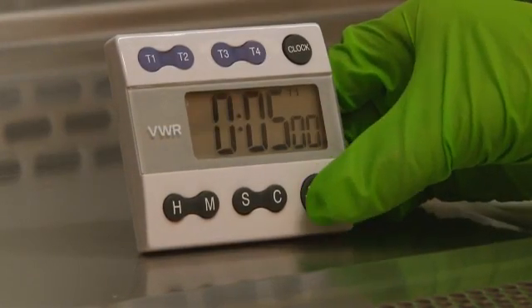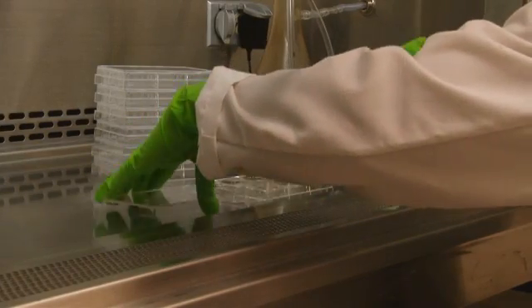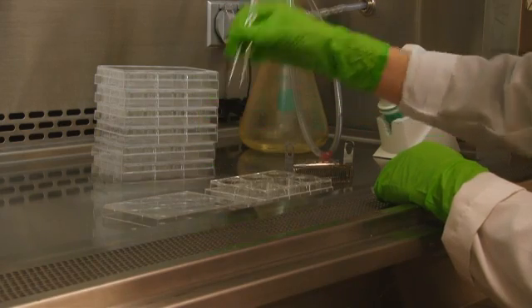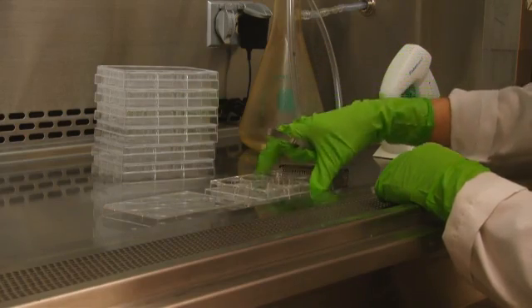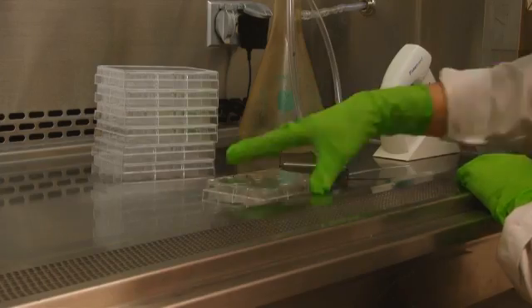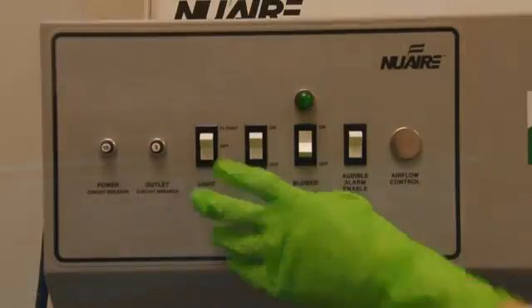After treatment, remove the subbing rack and dry the cover slips in the culture hood or a heated oven. Clean, dry cover slips are then inserted into each well of a 6-well culture plate and covered with a lid. To save time, large volumes of plates can be prepared ahead of time for later use. The plates can also be sterilized by placing them under the hood's UV light.